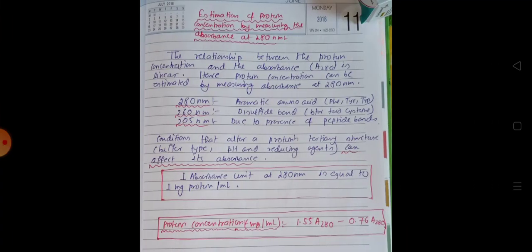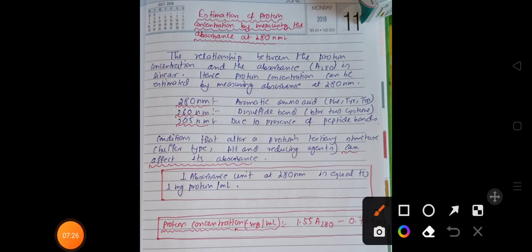So let's move on to the very important part. I have told you that the 280 nanometer absorbance of protein is due to aromatic amino acids, right? Along with that, there are two more wavelengths where protein also gives a good absorption.